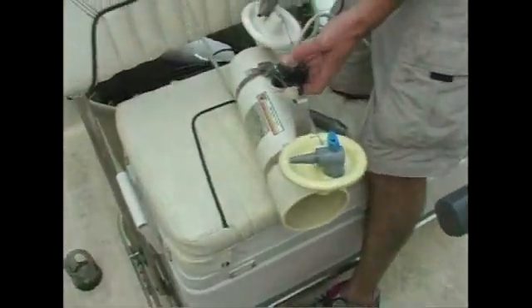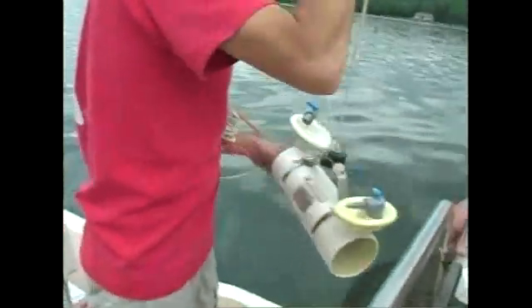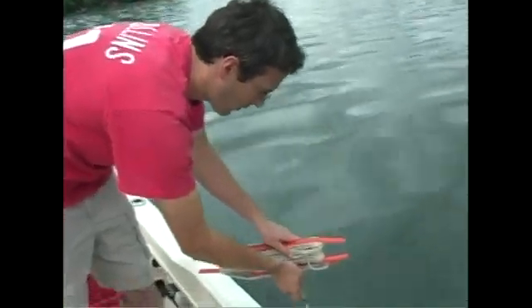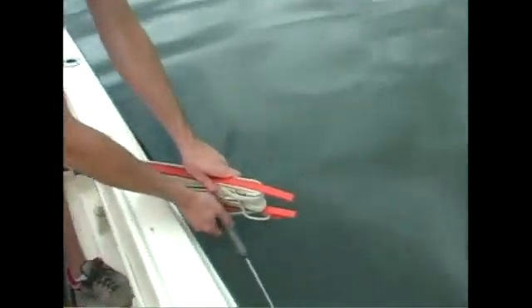So again, this is marked off in meters, so we'll just count them down as we go. All right, so that's 11 meters — send down the messenger.